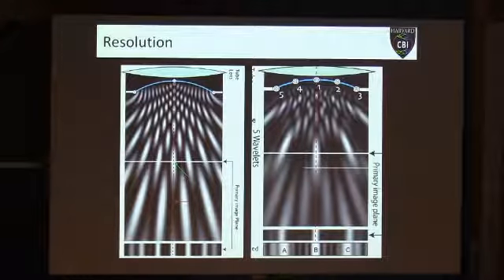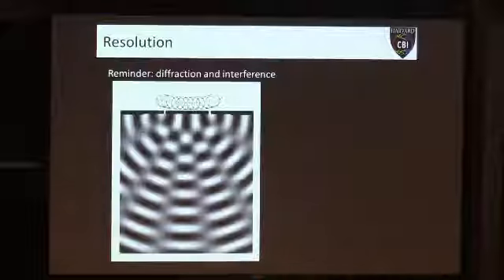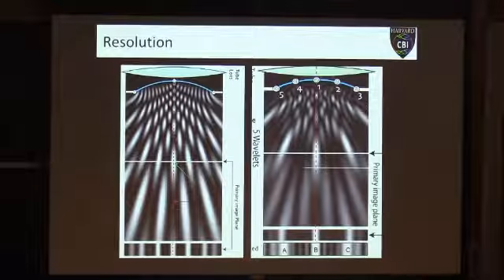And there's also one difference here between what I was showing you before. This here is just a snapshot in time. What's happening here is an aggregate of a whole bunch of time points. Okay, so what we see is here's where our primary imaging plane is. You can think of this as where your camera chip is sitting. And if we just had 3 little waves, we see a diffraction pattern that's still fairly similar to what Young saw with the double slit experiment.